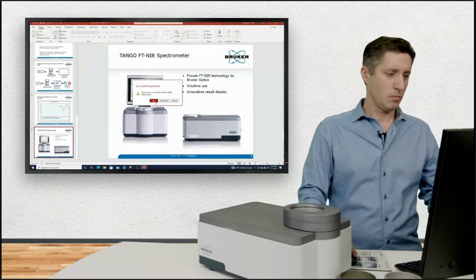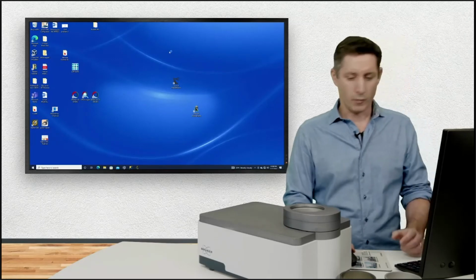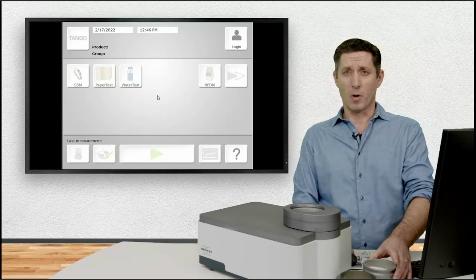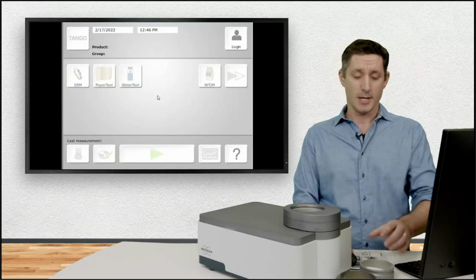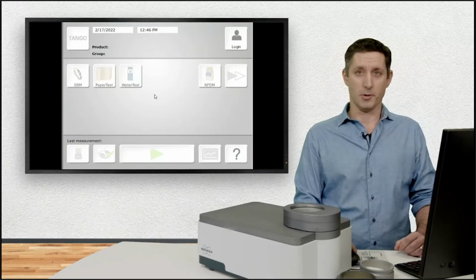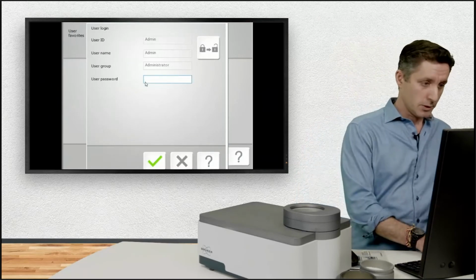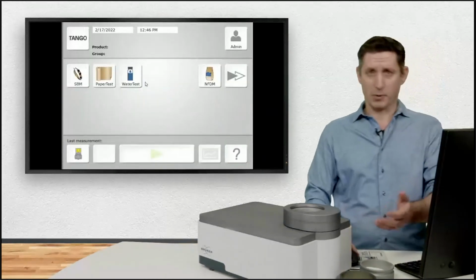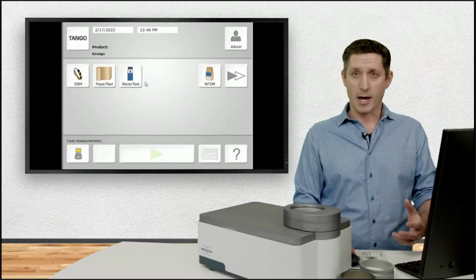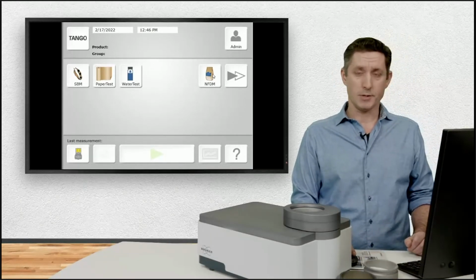So I'm going to bring up the software very quickly. So what I've done here is I have put together a very simple conformity method using non-fat dry milks. Milk powder is a very popular food supplement worldwide. It's also a very heavily adulterated food sample. So this could apply to anything like the cranberry or the grapeseed extracts that Chris was previously talking about. It would be the same type of application.